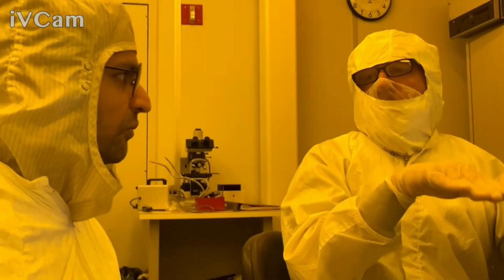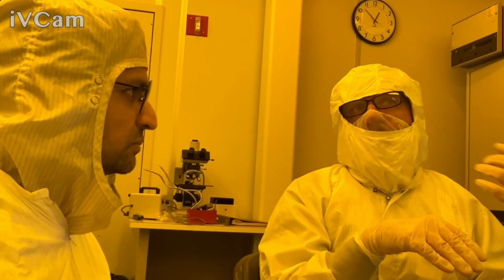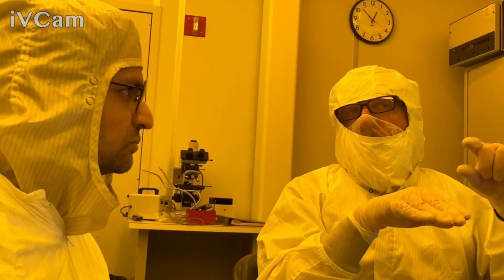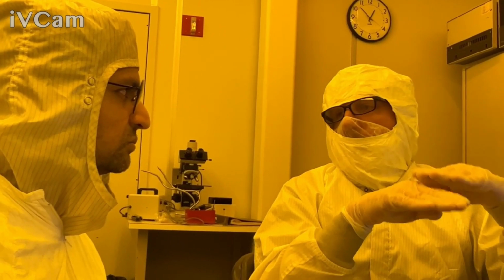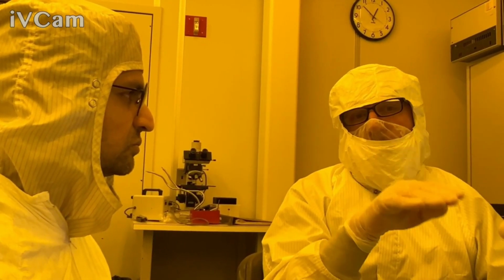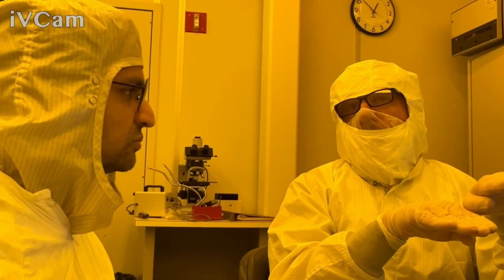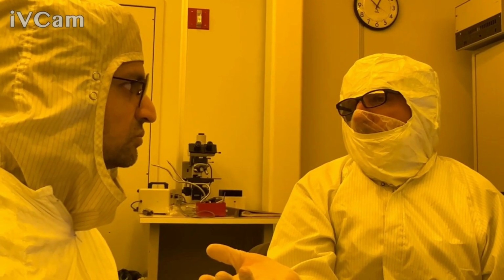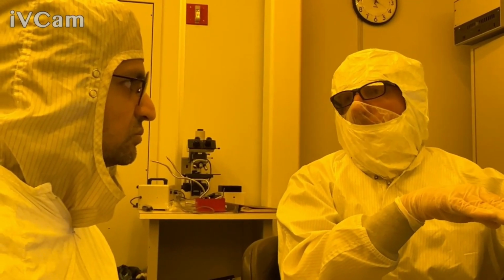If there is a film at the surface that is, say, a few nanometers thick, it will be sensitive to it, as long as there's some optical contrast. So essentially, when we're looking at optical roughness, what it's going to do is add a surface layer of lower index. So let's say that you had a silicon nitride film. So you have silicon nitride, your index is 2.